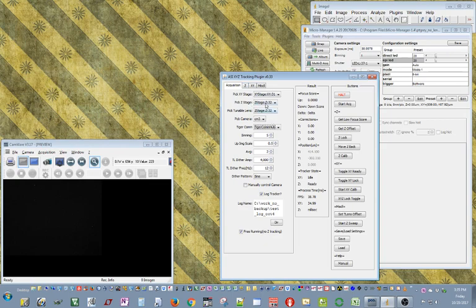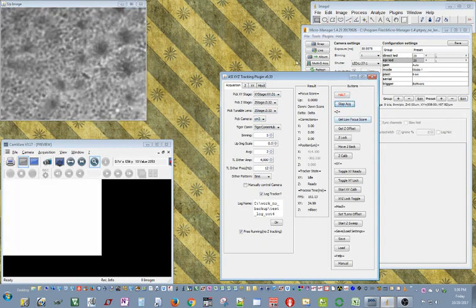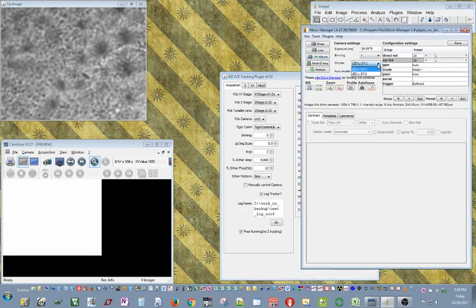For this demo, we won't be running Z, so it doesn't matter if you have a Z driver or not, just XY with a Tiger system and a camera is all that's needed. I'm going to start acquisition, and I'm using direct illumination.